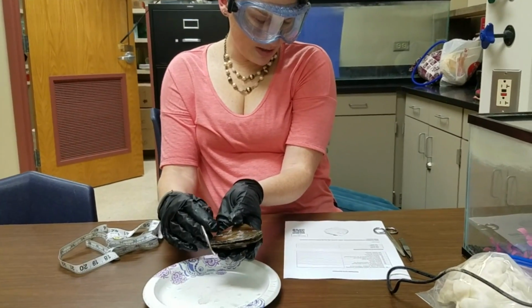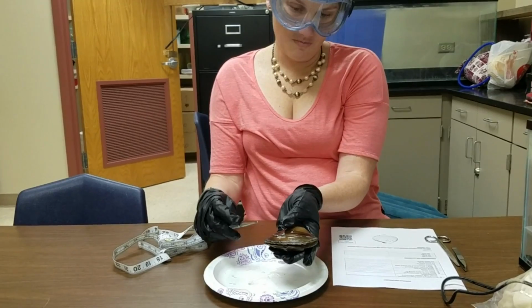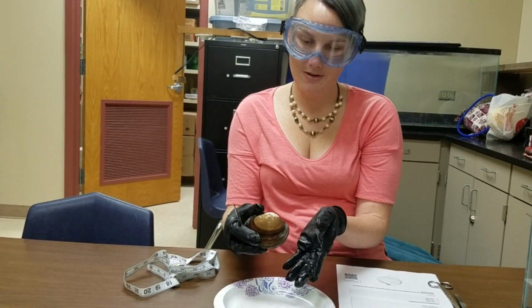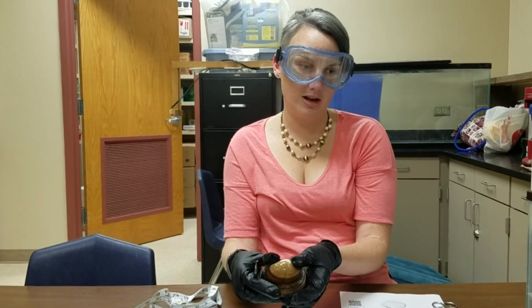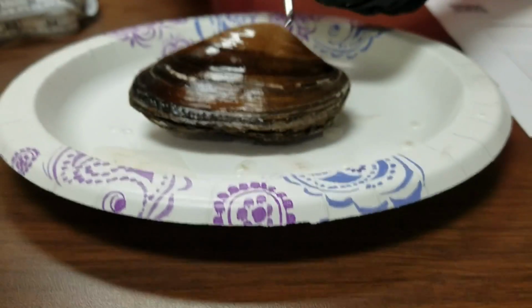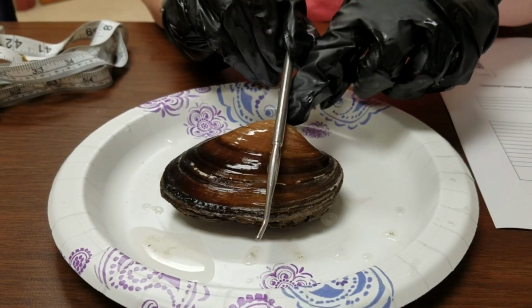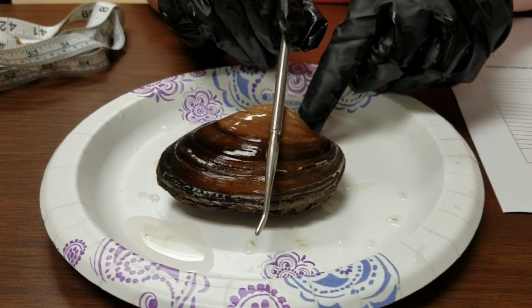Okay, then you're going to find the dorsal, ventral, anterior, and posterior side. With clams, even though you've defined them and they do mean kind of different things, I'm going to show you how to figure it out, and we group sets of them together. So, looking at your clam, you're going to line up your probe at the umbo, because we just talked about the umbo a second ago. So line up your probe at your umbo.